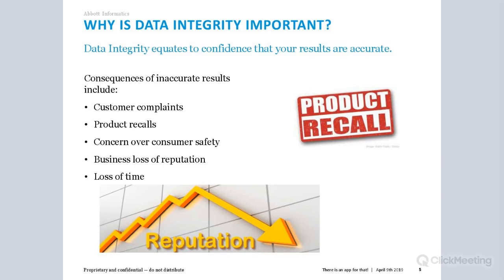Okay, so an immensely important part of modern regulations, such as FDA 21 CFR Part 11, which anyone in the pharma industry has heard 1,000 times, which basically is just the electronic requirements for compliance, deals with data integrity and demonstrating your business is maintaining it at all times. I have spoken about why accreditation is important, but let's take it down a level and look at why data integrity is important. What could happen if our business did not maintain data integrity?